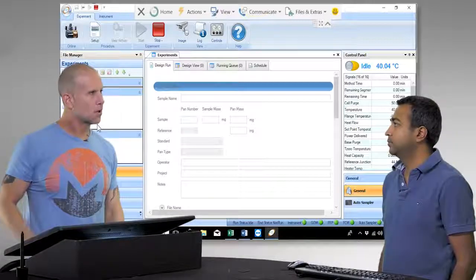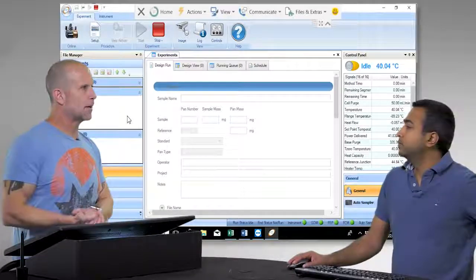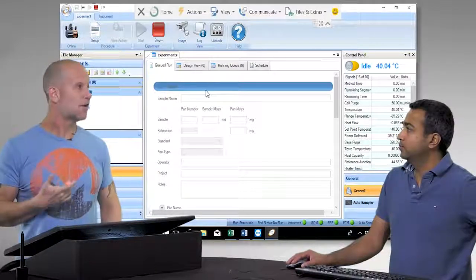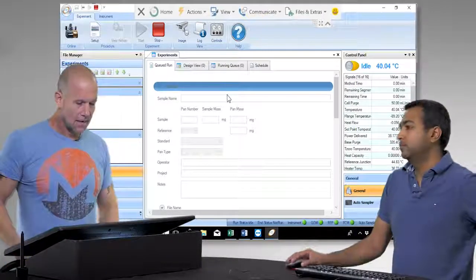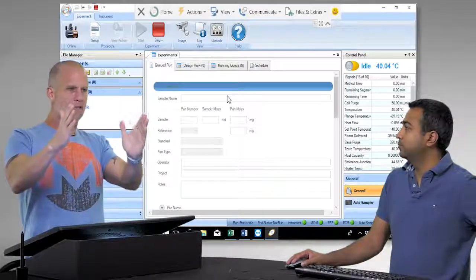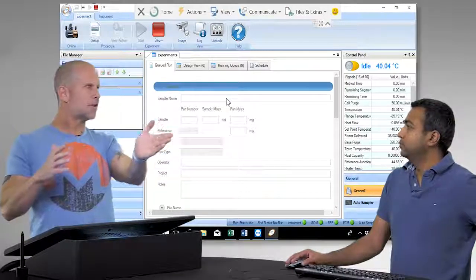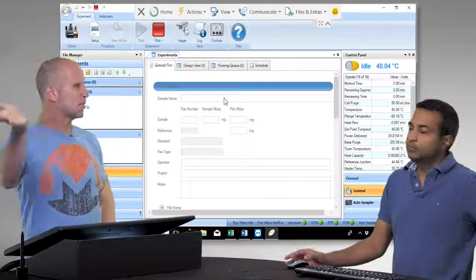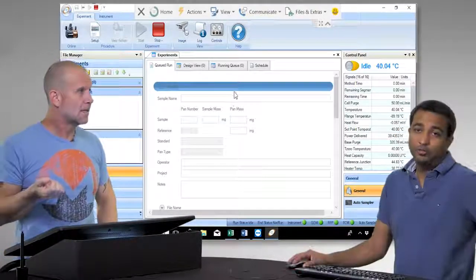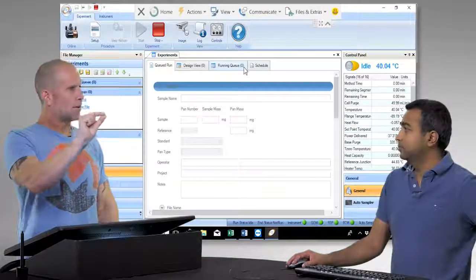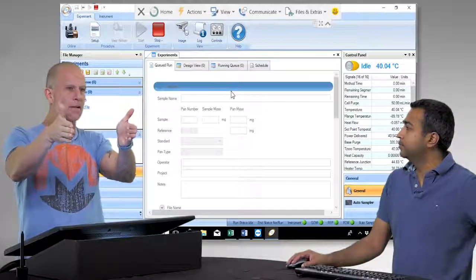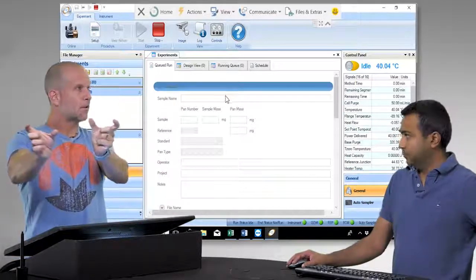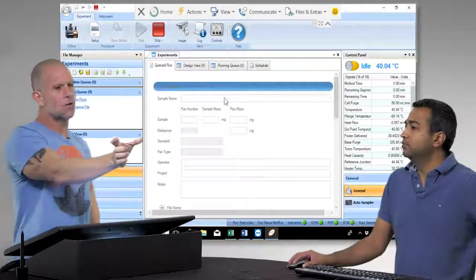We put a sample in position number three and now we're going to run it. The first step is to design the experiment. We know indium has a melting temperature of 156 degrees Celsius, and we know its enthalpy of fusion. So we'll run about 20 degrees below melting — starting around 130 — and then go about 20 degrees above, up to 170 or 180. We'll ramp at about 10 degrees per minute. That gives us a baseline showing heat capacity a little before and a little after the melt.